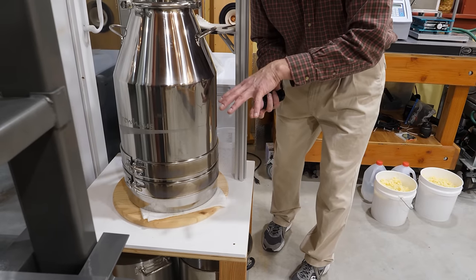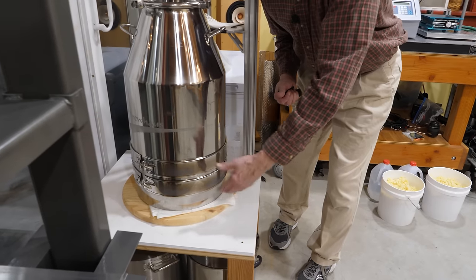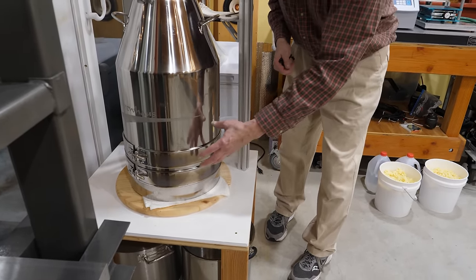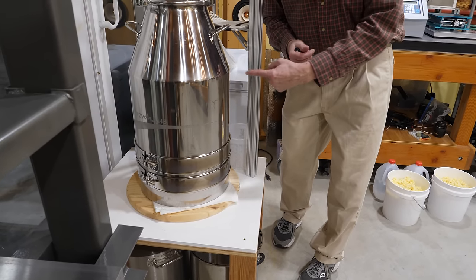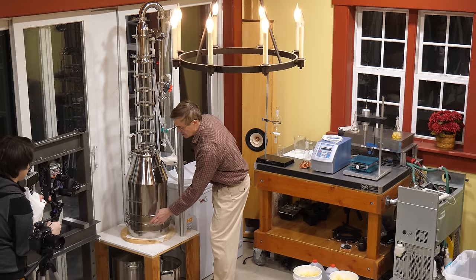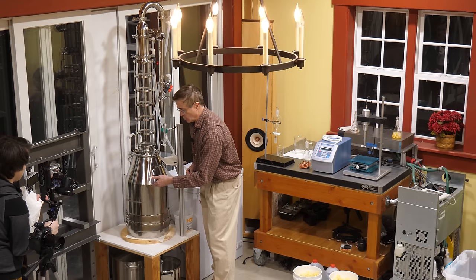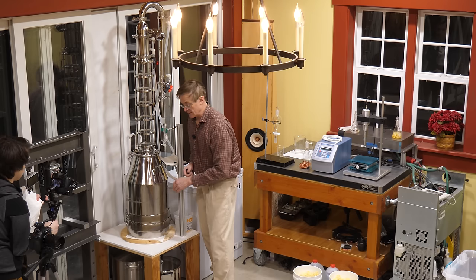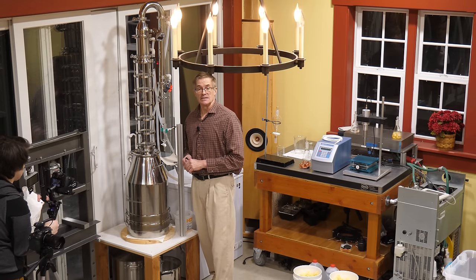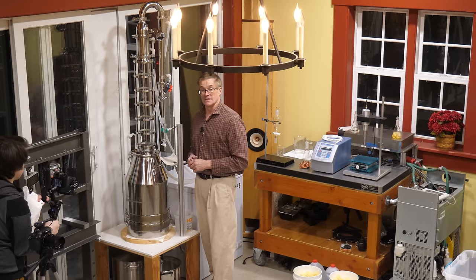Any particulates sitting in the pot tend to settle toward the bottom, and normally if you were heating with a hot plate or burner, all that heat has to go through those particulates making scorching more likely. The surface area of these band heaters is far greater than an immersion heater, and this works very, very well. Each one is rated at 1500 watts, and with both on, in about 40 minutes we can heat up the 40 liters of liquid inside. You could control these using a Variac or auto transformer, but I've never found a need — if I want to turn the heat down I just unplug one of them.